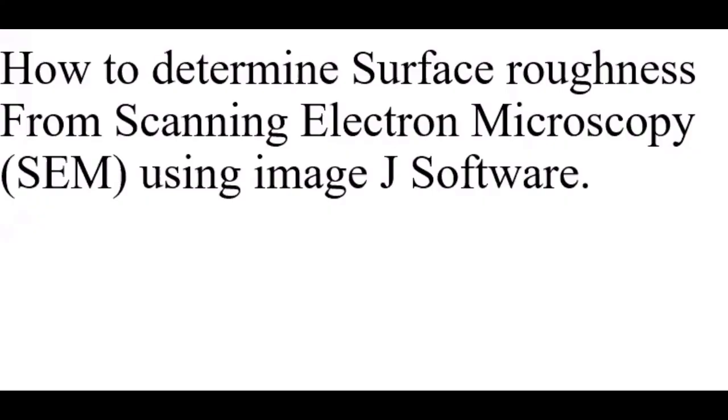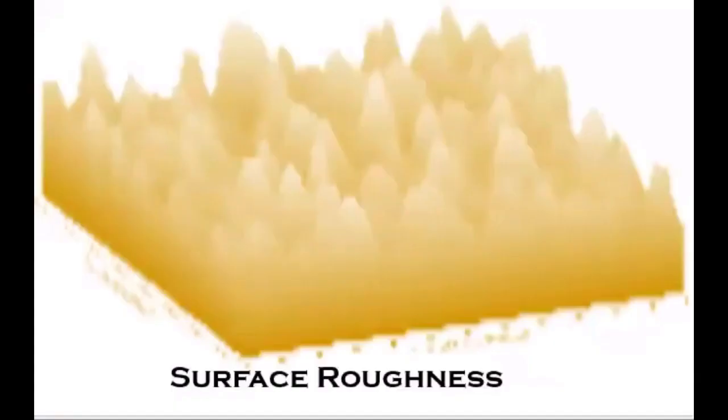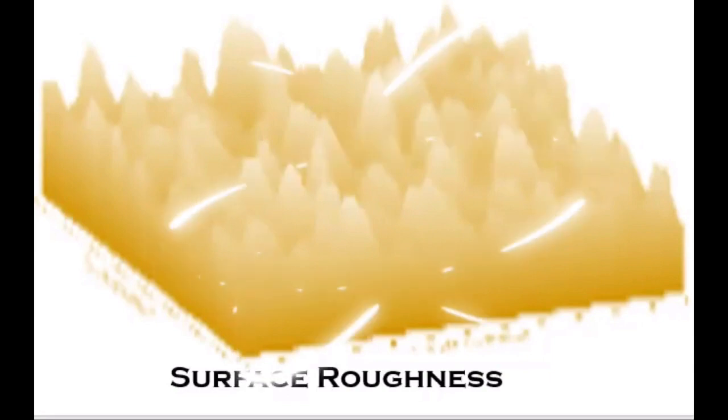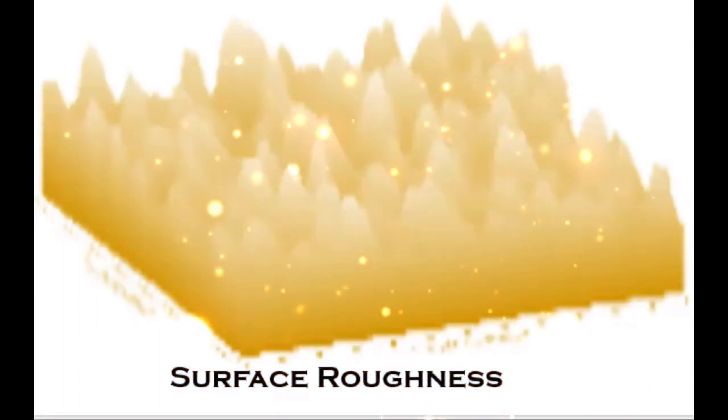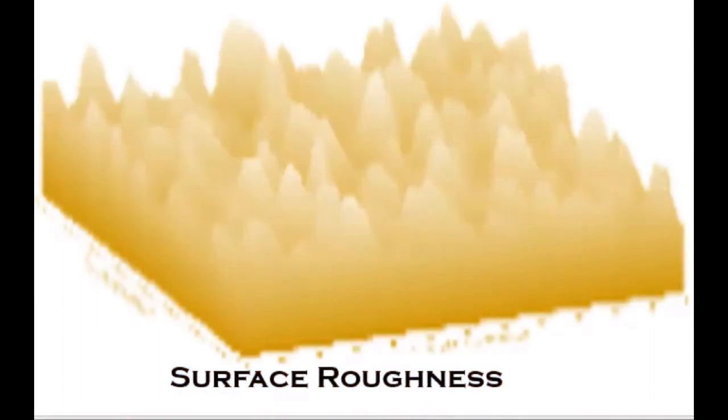Today's lesson is about how to determine surface roughness from scanning electron microscopy, SEM, using ImageJ software. The surface roughness of materials can remarkably change the way they interact with electrons, molecules, and photons. It determines the functionality and properties of materials.